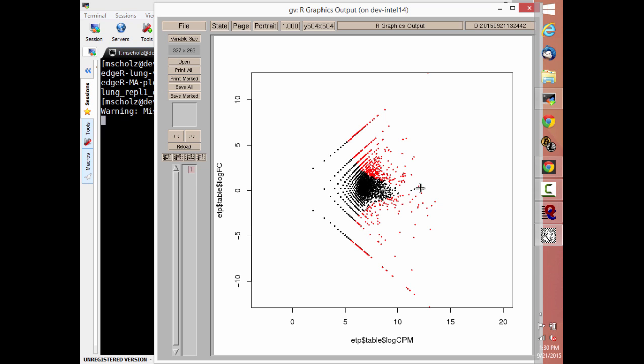Why is that? Not only do you have a lot of reads, there's the covering over the T here. There are more reads here, and it's a log scale, so this is a lot more reads. It's closer to zero, but it's still a lot more reads. There aren't any good ones here. There will be times, too, where you'll see one out here that's an outlier that's not red, right? That the FDR fails.